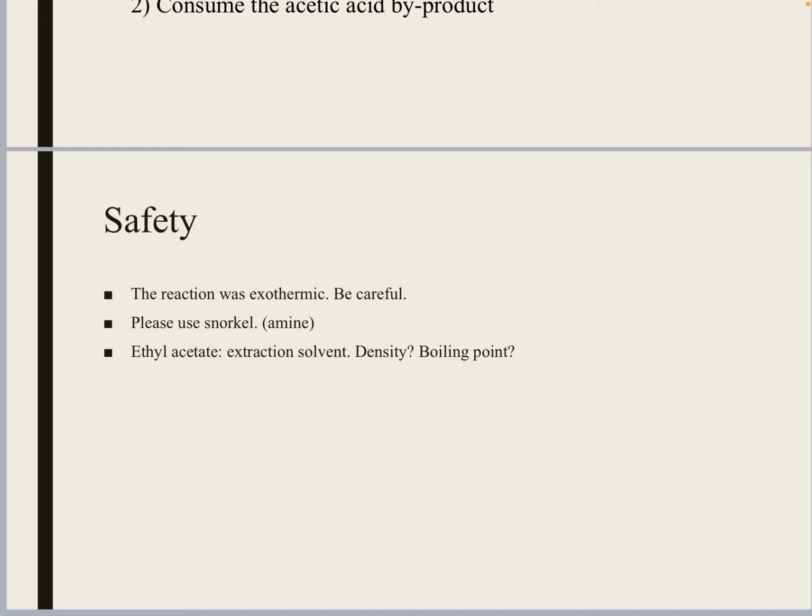How can I describe this? So the product you're going to be forming may have a lower boiling point, it may have a lower melting point compared to the boiling point of ethyl acetate, which means that it will remain in a liquid form on the hot plate, although all the ethyl acetate evaporated off. So if I were you, when you have very minimum amount of liquid left, you can take it off from the hot plate every now and then to see if it's solidified or not. If it's solidified, then you don't have any ethyl acetate.